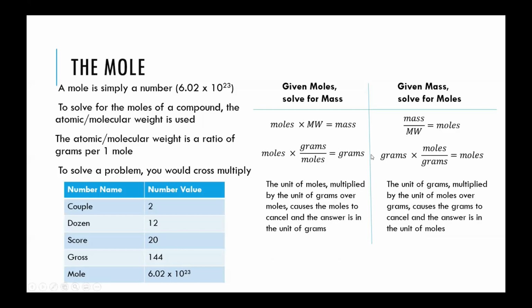Overall in chemistry, there's a lot of this interconversion between grams and moles, and then moles to grams. And this experiment focuses on these types of conversions. You're going to be going from grams to moles, from moles to moles using the chemistry, and then from moles back to grams of something else.